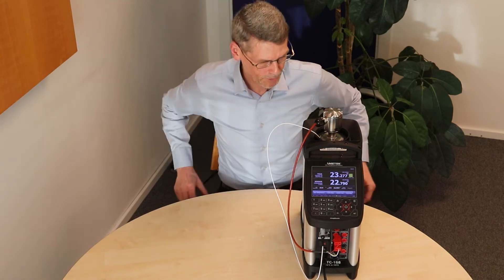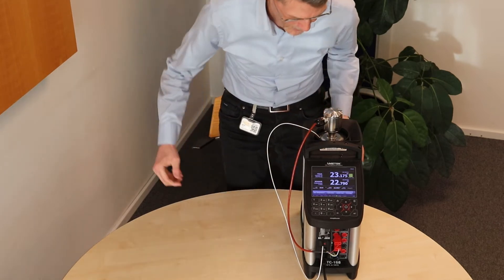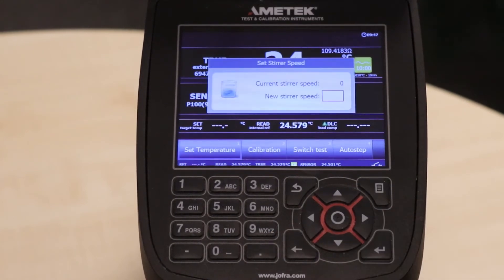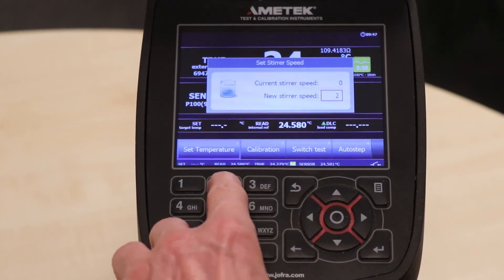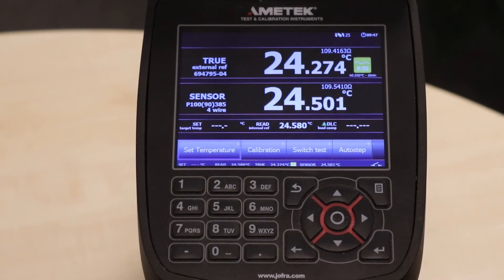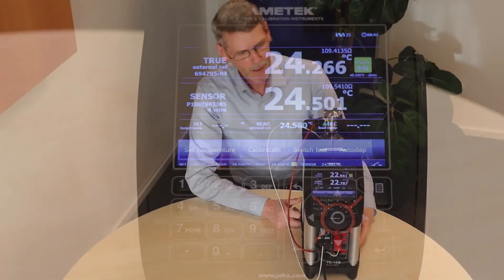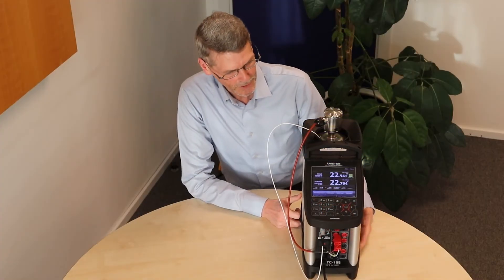Now we need to set the steerer speed. We go into the menu, go into the steerer setup, and we set it to 25. You can now hear that the steerer is running. The setup is ready and we can now set a temperature.